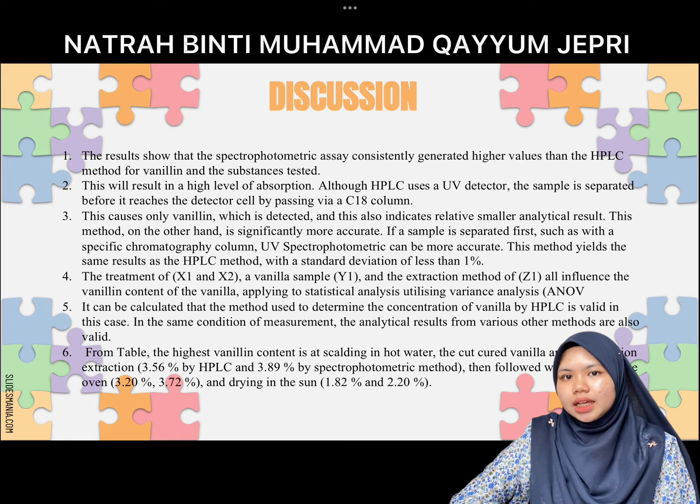It can be concluded that the method used to determine the concentration of vanilla by HPLC is valid, in this case, in the same condition of measurement. The analytical results from various other methods are also valid.